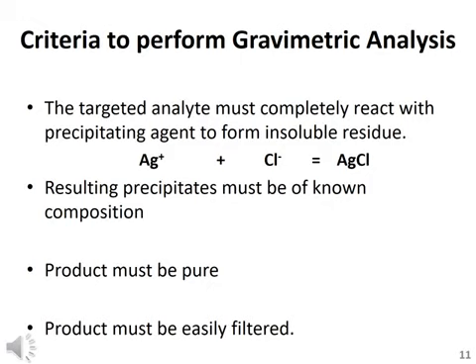And if the precipitate is large in number, then there is a chance that their sizes will be smaller, and when they have a smaller size and a large surface area, there are chances that they can react with the mother liquor, as smaller particles have greater reactivity. So the precipitate must be pure, and it must be in less number but bigger crystals of precipitate in the mother liquor.